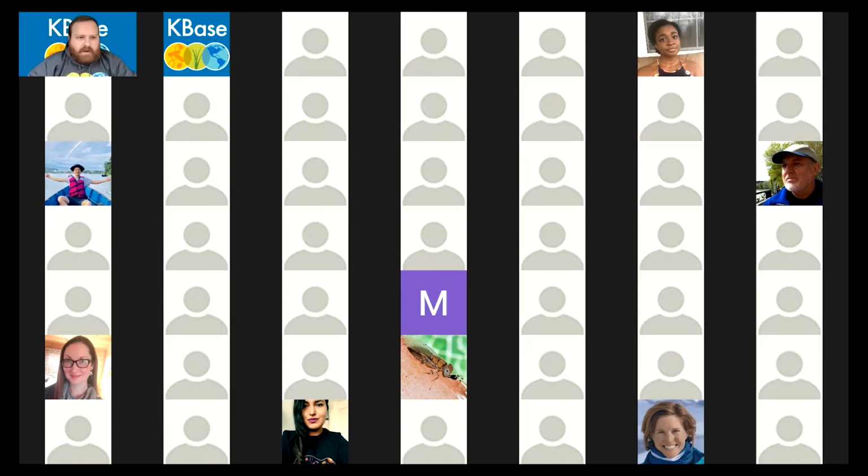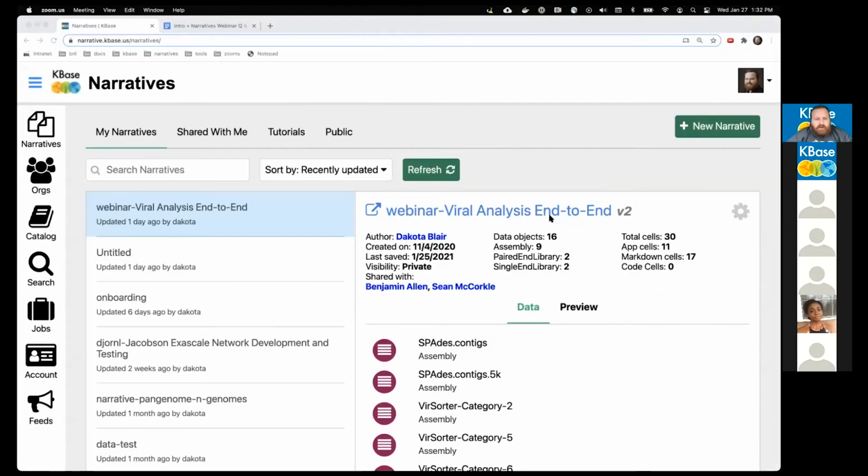Sure. Okay. So what I'm going to be showing you is the narrative view here, where we can see information about all of our narratives.